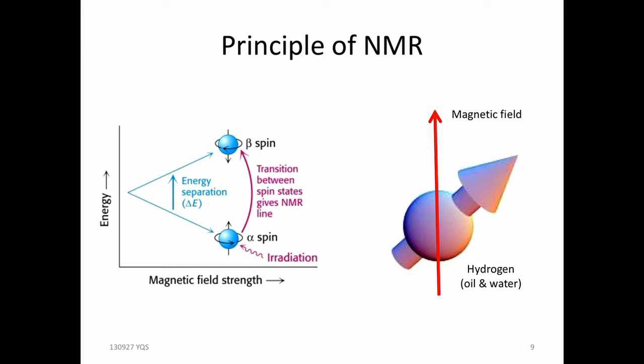So a few words about the fundamentals. MRI is actually quite simple. The name is magnetic resonance, so you've got the magnetic part.